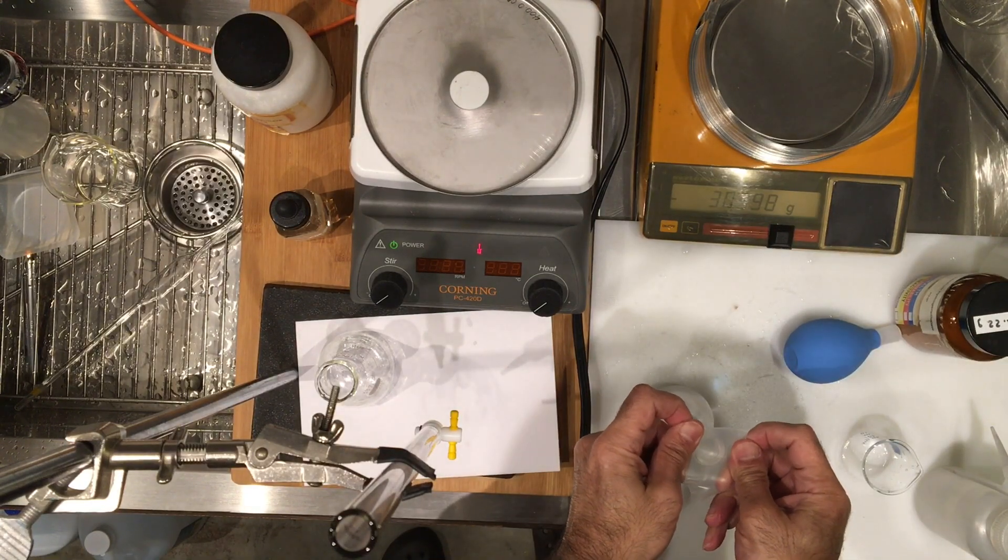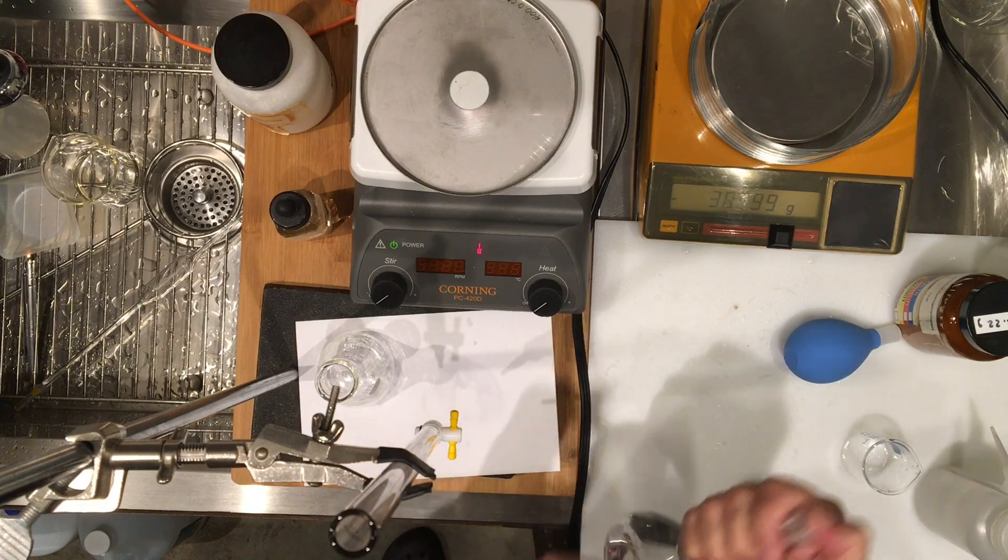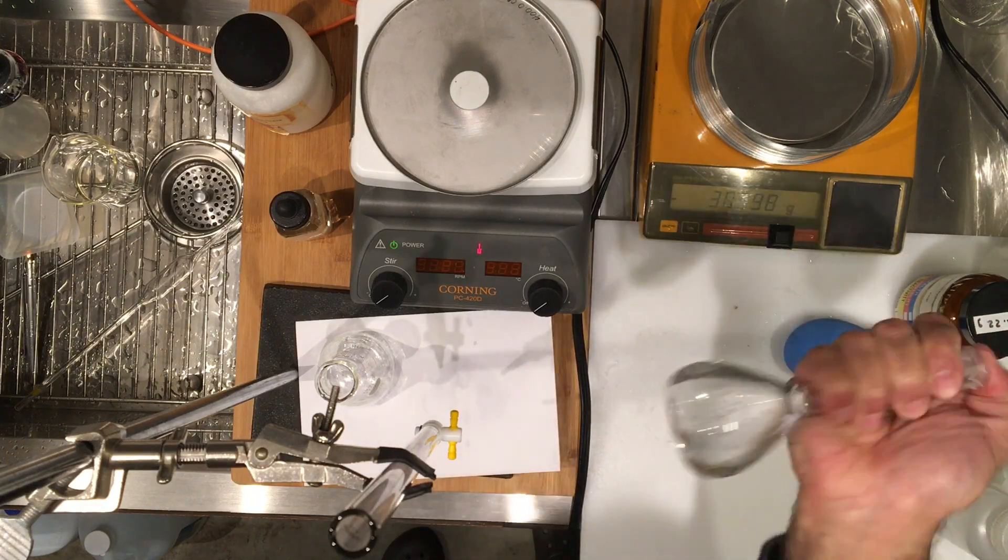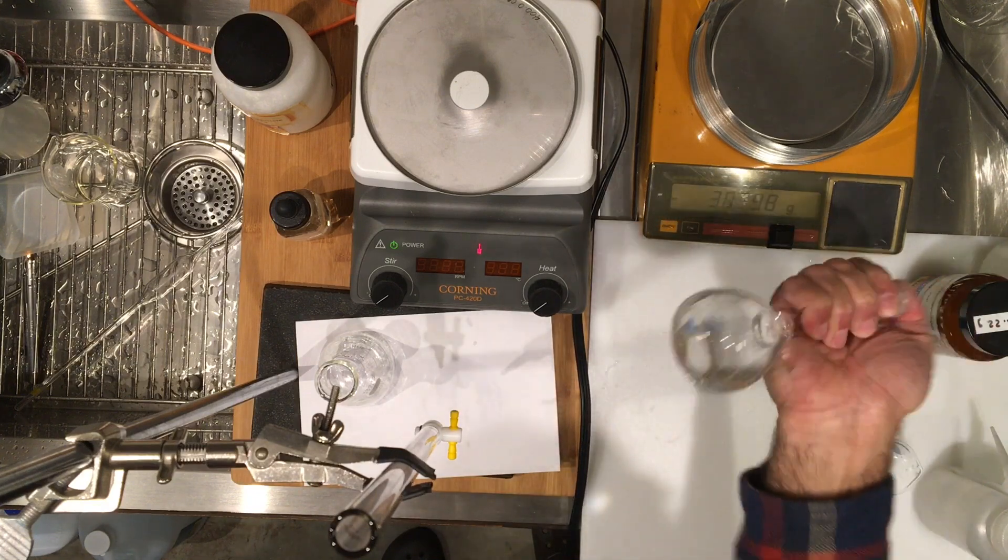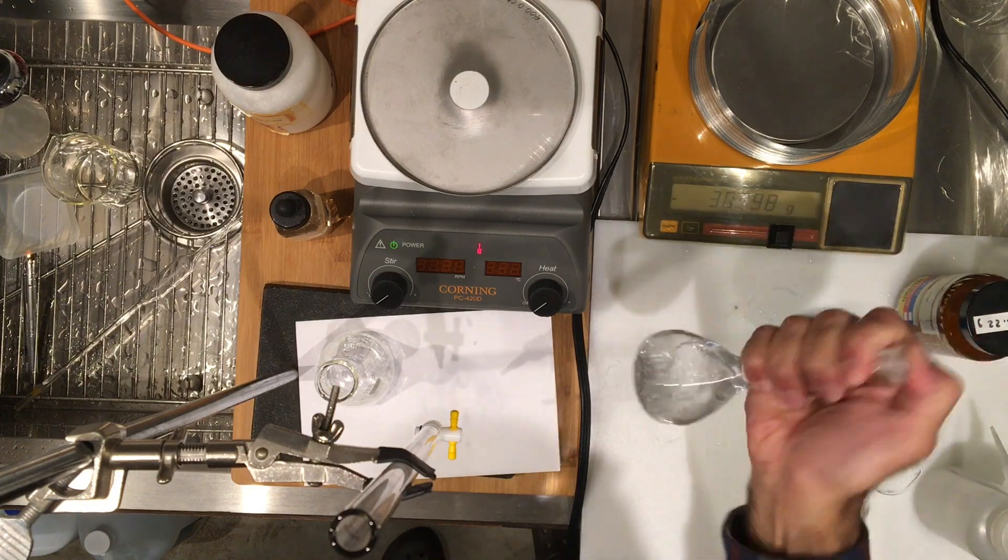So I stretch the parafilm over the flask, and I mix this a few times up and down, and this will mix my vinegar with the water so it's diluted to a known concentration.